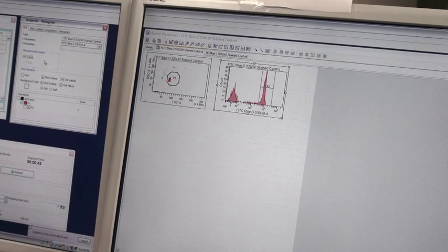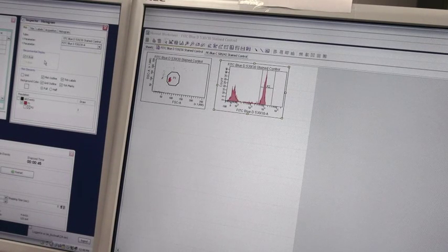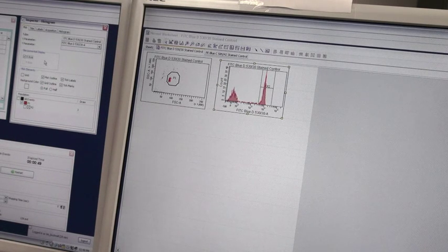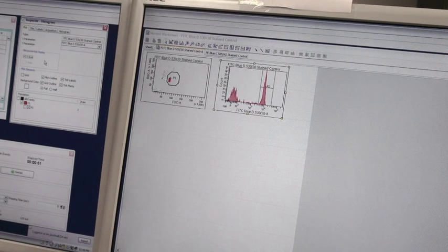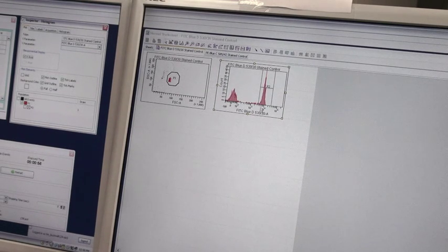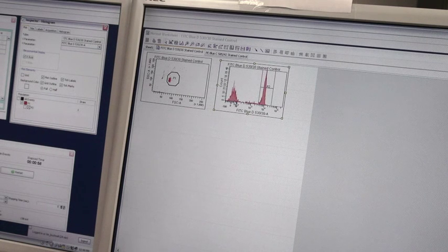Here we are collecting single stain controls for compensation using the BD Compensation Wizard. We have on our sample the FITC stain sample showing a nice clear positive peak and a negative peak. Here's our positive peak, and here's our negative peak.